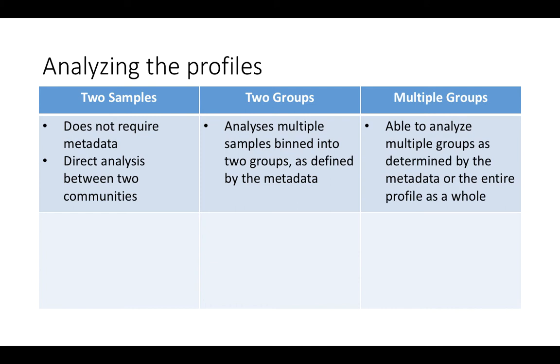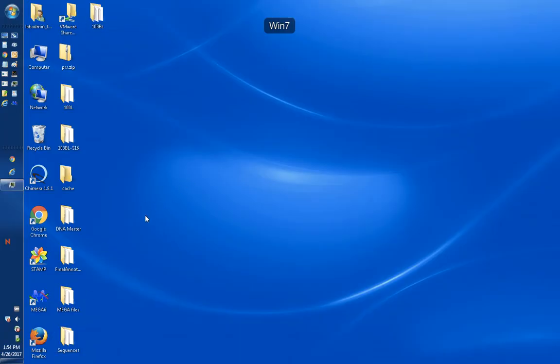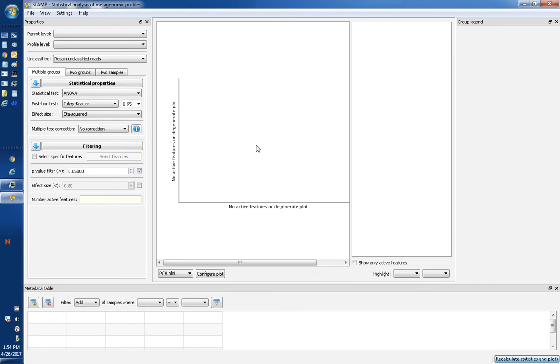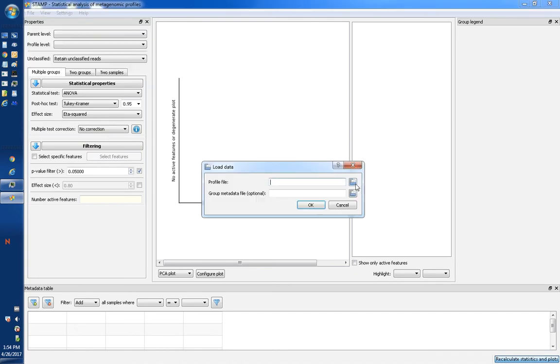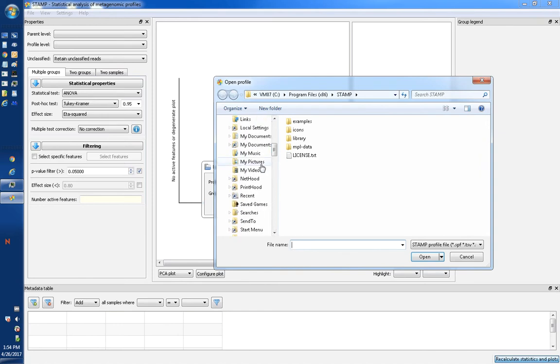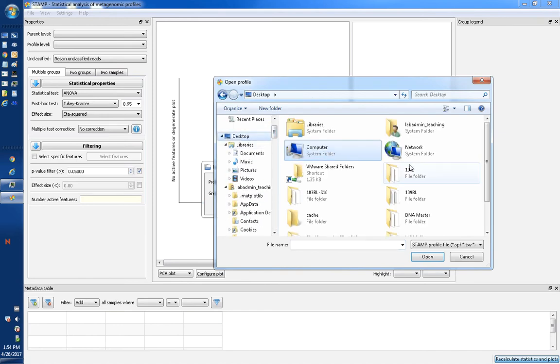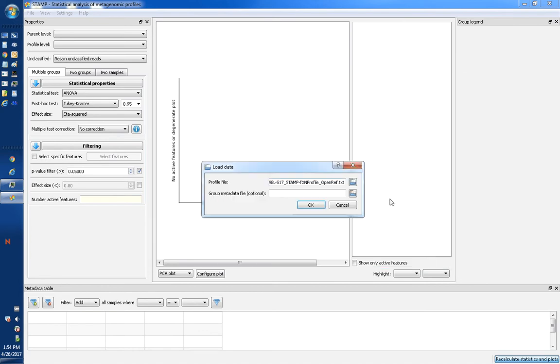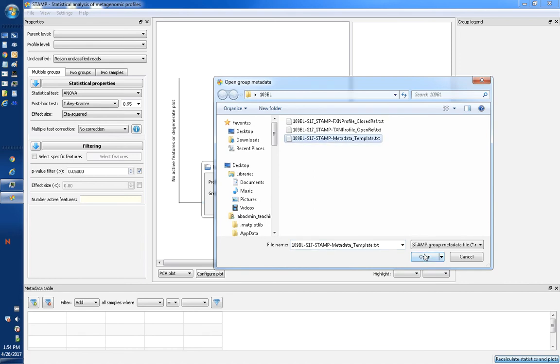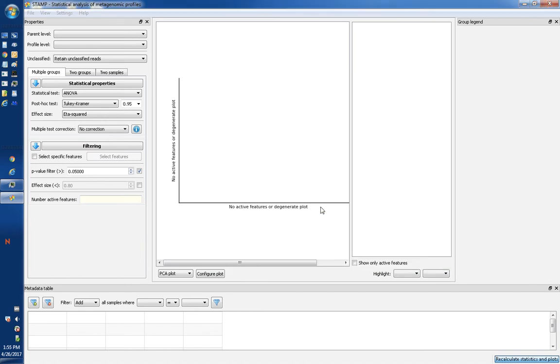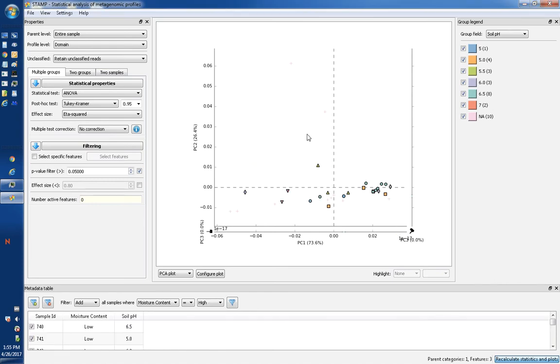Now it's your turn — think about which questions you can ask for each level of analysis. Let's get started. First, open up your version of STAMP software. This is the graphical user interface for STAMP. Go to File, then Load Data, then select the proper profile and metadata files for your analysis. Know that STAMP doesn't read Excel files, but can only read TXT files. STAMP might take some time to calculate statistics for your analysis. Once it's ready, you'll see your figure in the central plot window, the options for your legend to the right, and your metadata table towards the bottom.